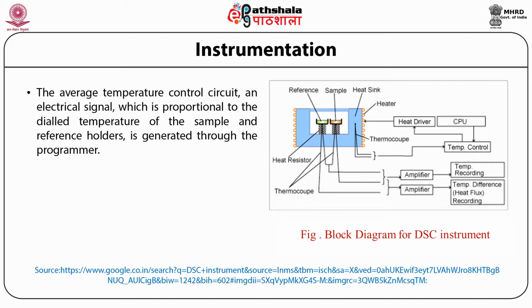By DSC, one may analyze liquids and solids in the form of powder, crystals, granules, or foil. An inert material like alumina is generally used as reference material. An empty pan with lid is also used. Environment: generally, DSC measurements are carried out in a gas environment. The optimum rate recommended for flowing gas is 20 to 30 milliliter per minute.